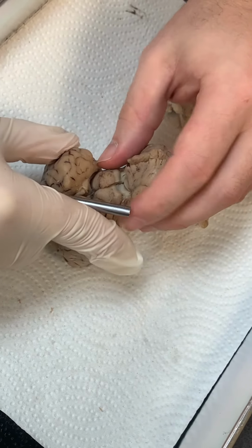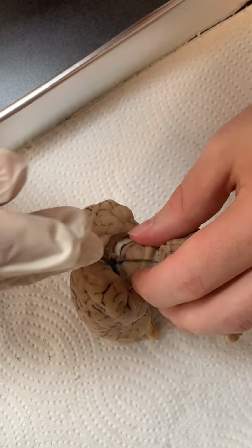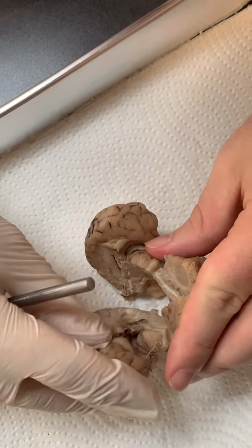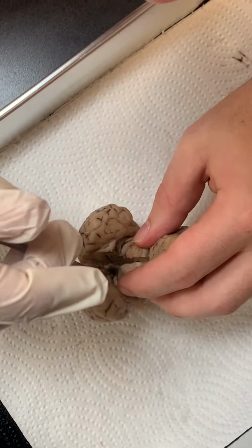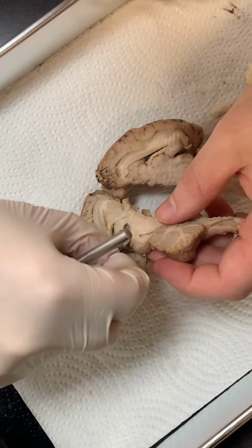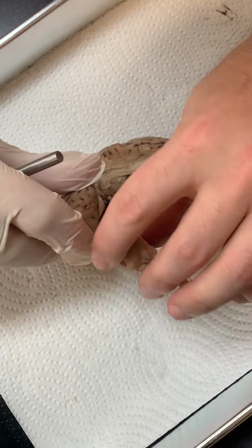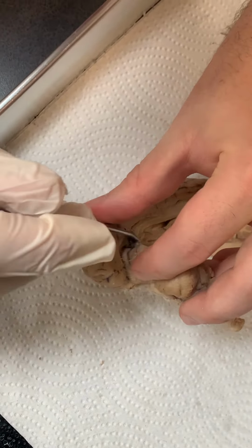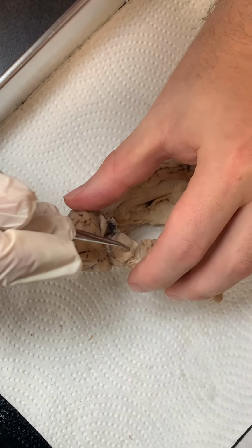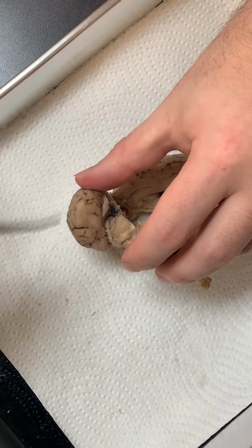Okay, and then coming out the top here, if we can find it in here. All right, it's just stuck on the one side, so that looks funny. Hang on, let me get this out here. We got some stuff in the way. If you were to look in the back here, I'm just going to do it on this one side so I can hold it open. We have what people like to describe as the hemorrhoid from the baby's butt. So baby's butt, this would be the hemorrhoid. That is the pineal gland. That's what makes melatonin, makes us sleepy.